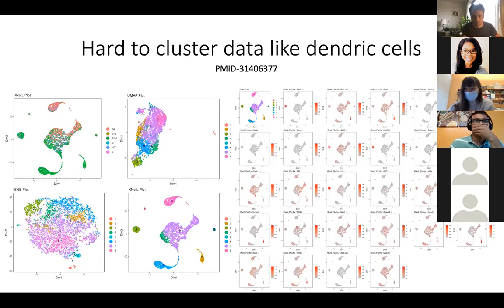Yeah, I could just jump in on that to make a quick note. I think the Ly6D point that you mentioned is very noteworthy here, because even in the analysis from the original publication, they were unable to discern a population that we know should be there, basically. And KNetL showed very clearly that this Ly6D population pulls out very neatly. And then the other note about the connectedness of the three clusters in the middle, the preliminary leading hypothesis is that they're all a very similar population that are hard to distinguish, more specifically dendritic cell progenitors that might actually be distinguished primarily by how quiescent or proliferative they are. That's what we think, but we have to do some more work to figure that out.